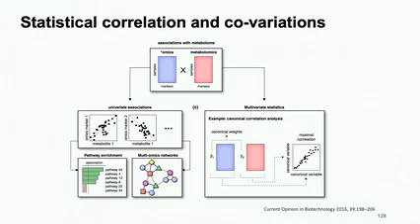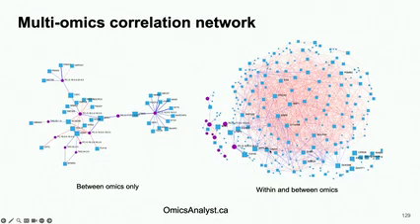If it's two matrices, CCA explains most covariance across two big matrices. So PCA is one matrix, and CCA is two matrices, how they covary with each other, okay? This is just intuitive like this. How it works internally, because it's linear, you can actually understand, but how useful it is is really case by case.